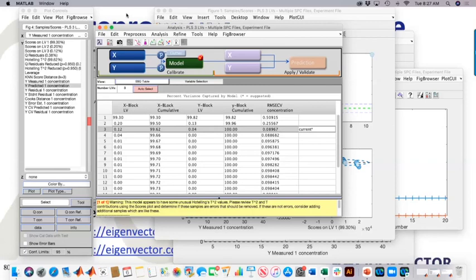So anymore, if I have to do a model, I use the model optimizer and create all possible combinations. Sometimes I wind up with 500 or 1,000 models and just tell it to calculate them all, look at that plot to find some candidates, and then whittle it down from there.